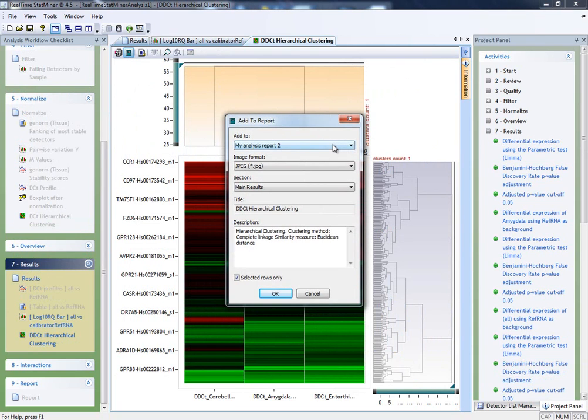There are default sections provided by the application to include the main results with visualizations that I might want to use for publication, or data summary with the tables including information on expression analysis, and a third section with data processing, for instance, for other intermediate results of the analysis. We can of course create new ones that fits in with our needs.